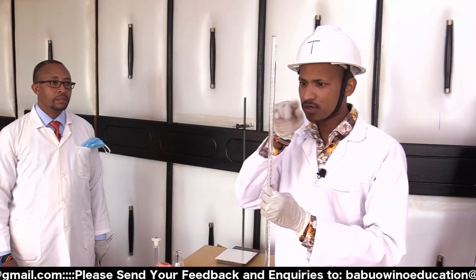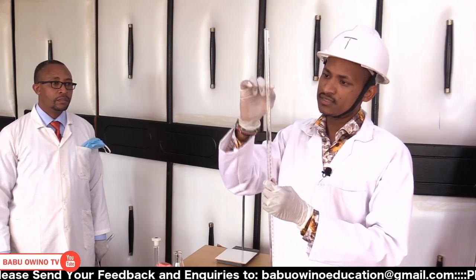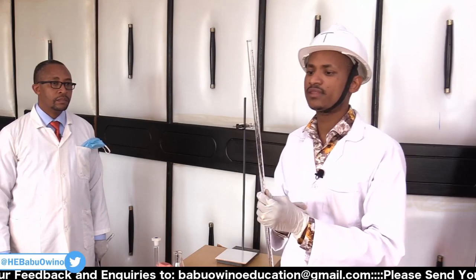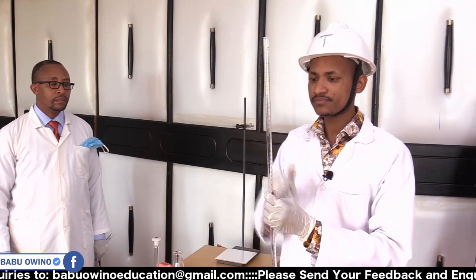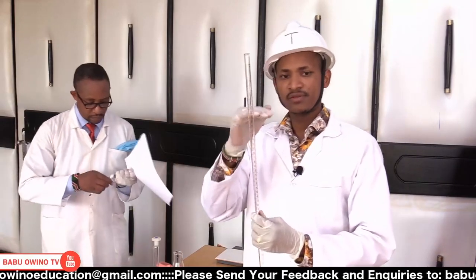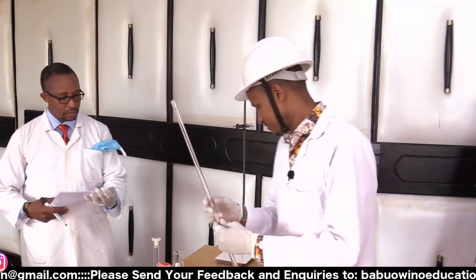That is what we call perpendicularly. And then you read the bottom of the meniscus. Whatever is here, which is the titrant, you read it at the bottom of the meniscus. I will show you how we will deal with it. Why do we read at the bottom of the meniscus? Because that is the level of the titrant. That is where it is. So when you read it perpendicularly, you avoid certain errors, error due to parallax.